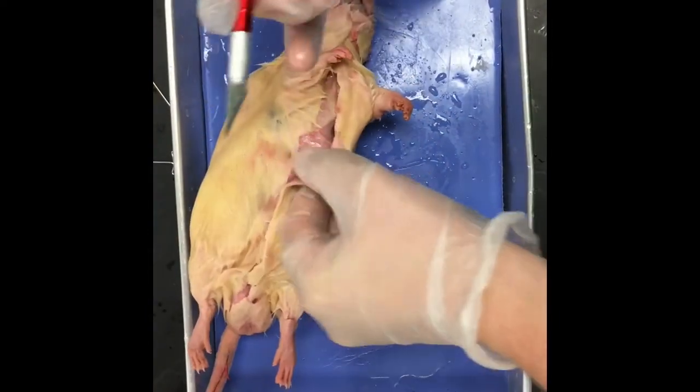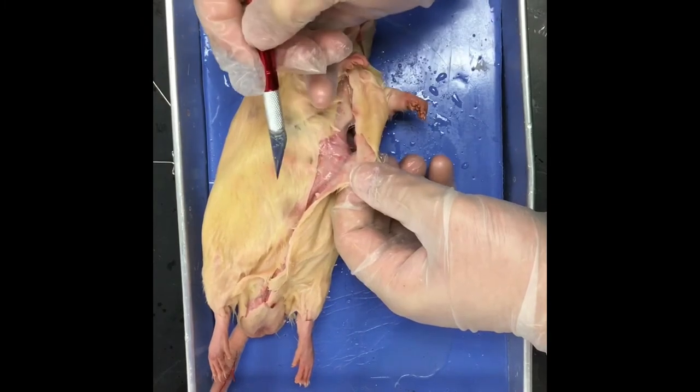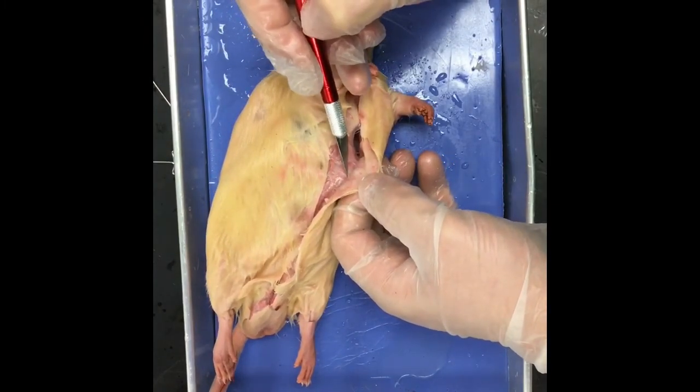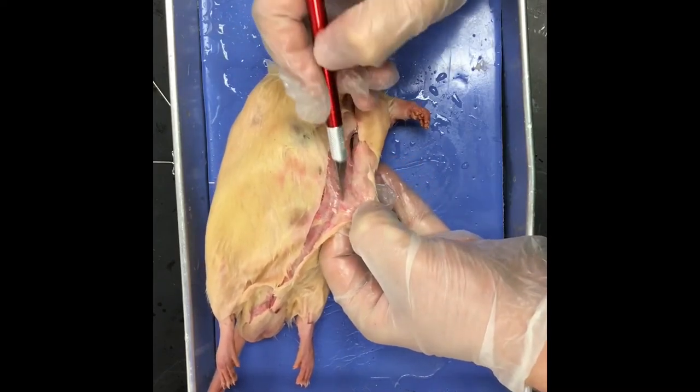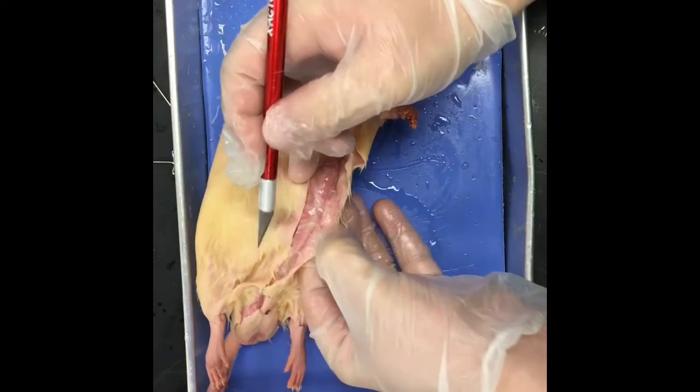All right, so the reason I use an X-Acto knife instead of a scalpel, guys, is this right here. You see, this is connective tissue. It's connecting that skin to the muscle. You're not cutting, you're just scratching with the tip, taking the tip of an X-Acto knife.